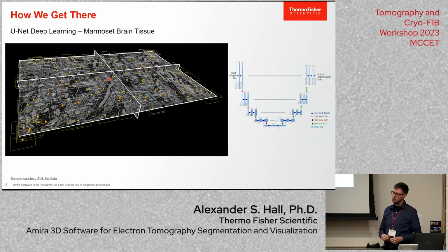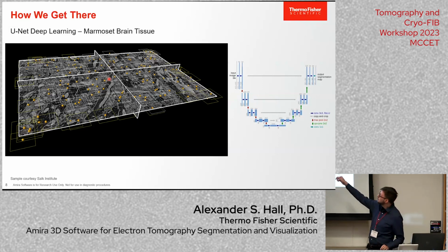On the right, this is a cartoon that's often shown anytime UNet is described. This is a kind of deep learning model. It's also called a convolutional neural network. Convolution is a kind of resampling, and each blue box here is representing a convolutional layer, as it's called. The number of layers determines whether or not it's considered deep learning versus, say, correlation is machine learning, right? Just standard regression is machine learning, but it doesn't have a lot of layers.